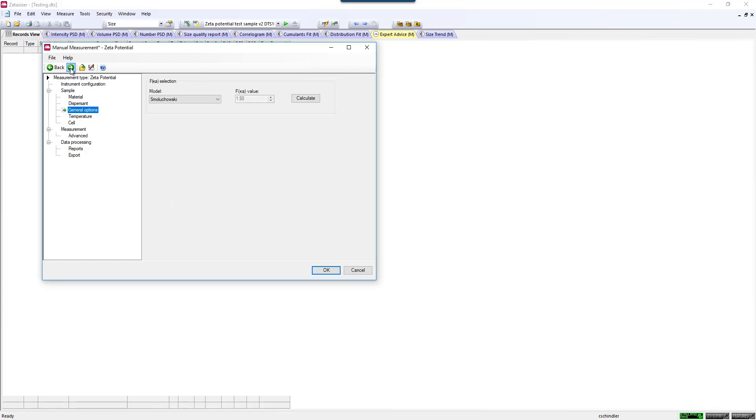The next parameter selects the model appropriate to convert electrophoretic mobility to Zeta Potential. There are two models built into the software, or you can create your own Henry function value.